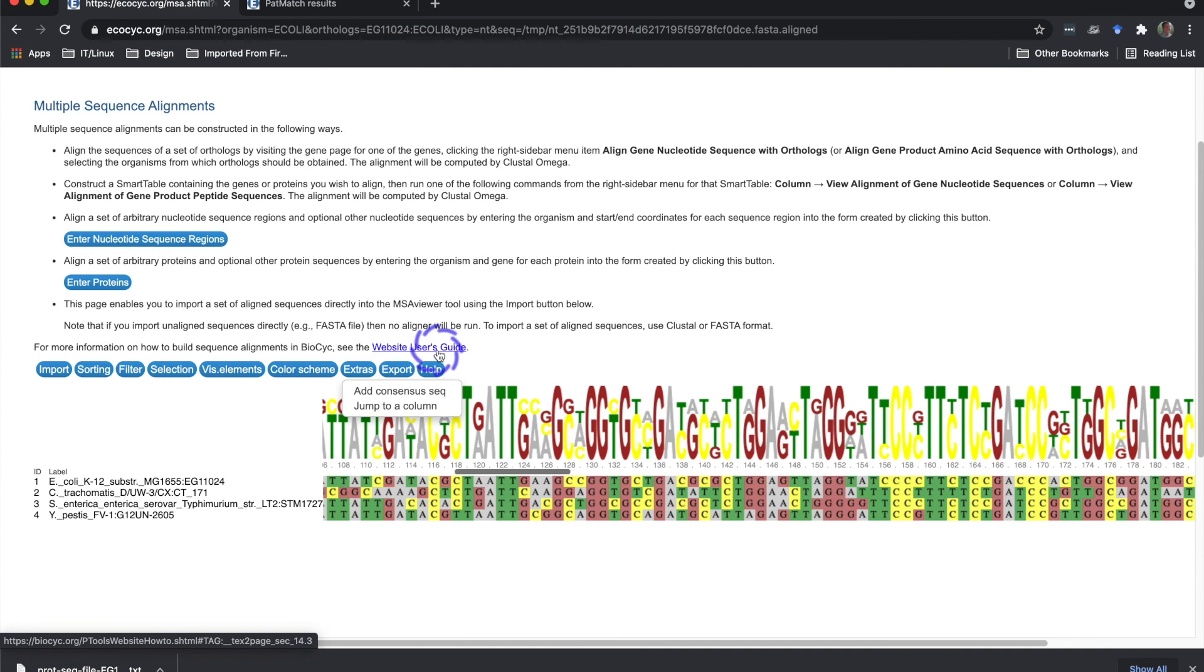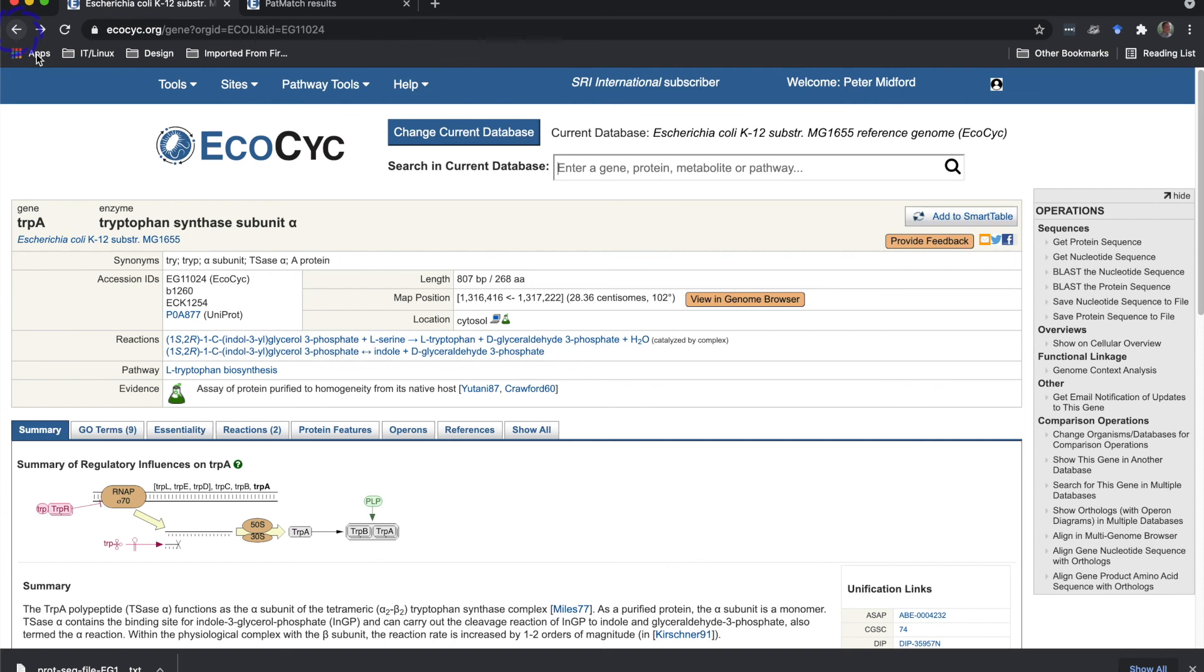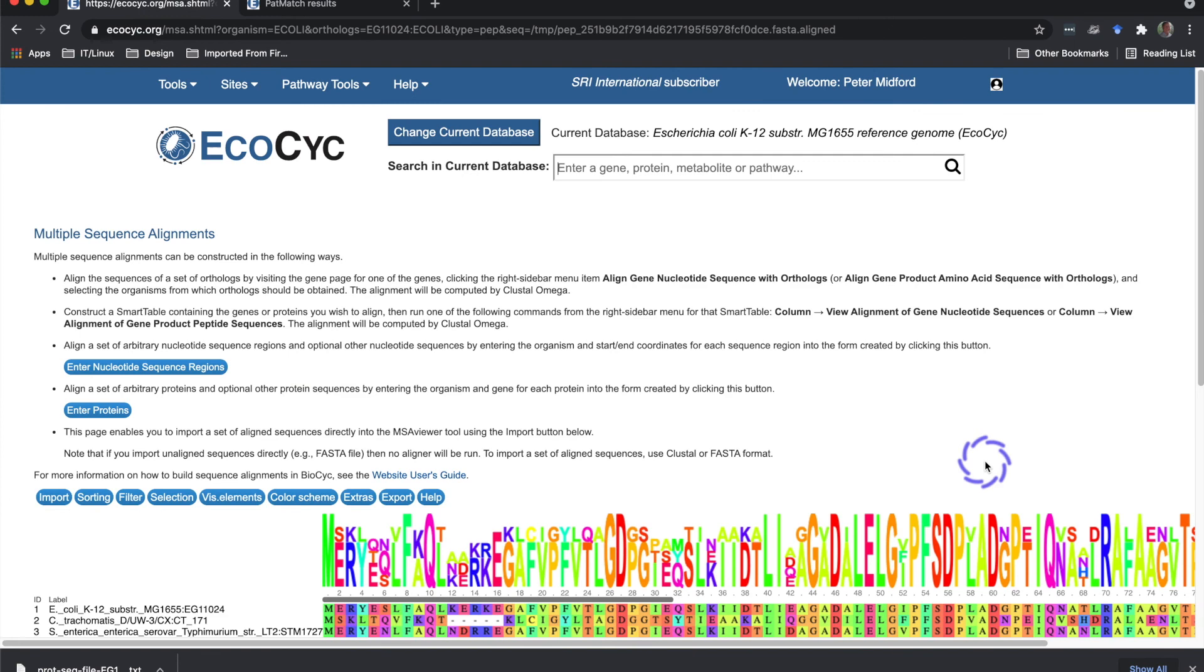I'll return to the gene page and show the alignment of amino acid sequences for a set of orthologous proteins with the align gene product amino acid sequence with orthologs command. The amino acid alignment view is similar to the nucleotide, except that the graphics and color schemes are more complex.